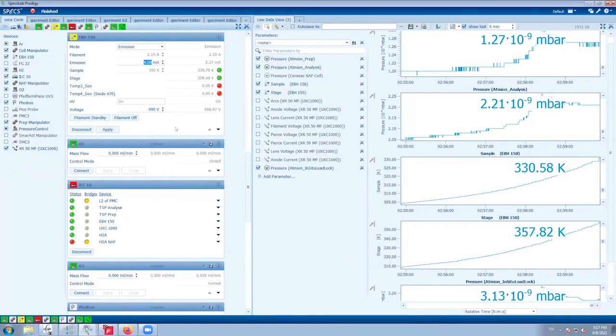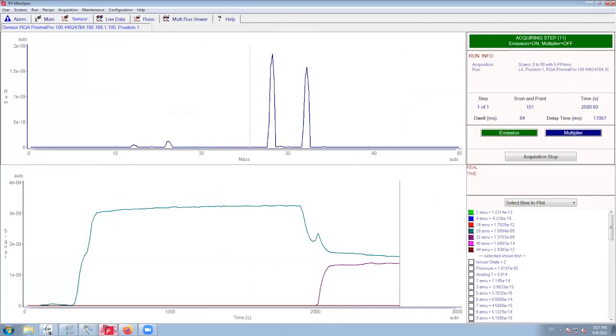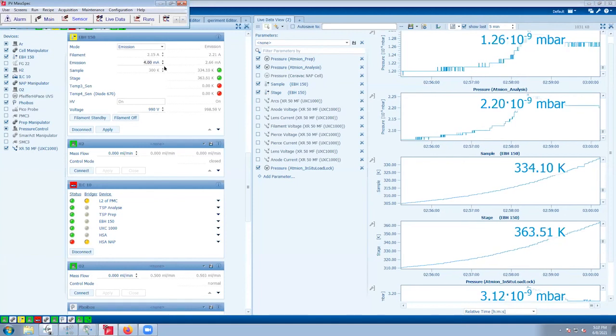As I told, when you apply a potential, you always see this potential in your spectra. Your spectra are shifted by the potential at the place where you measure. Yes. For example, if you measure on the surface and there is a drop of potential across the surface from one side to another, it would result in broadening of the spectrum.